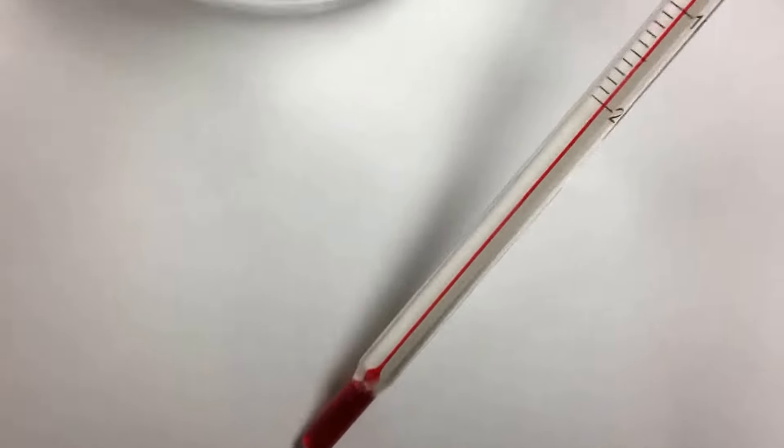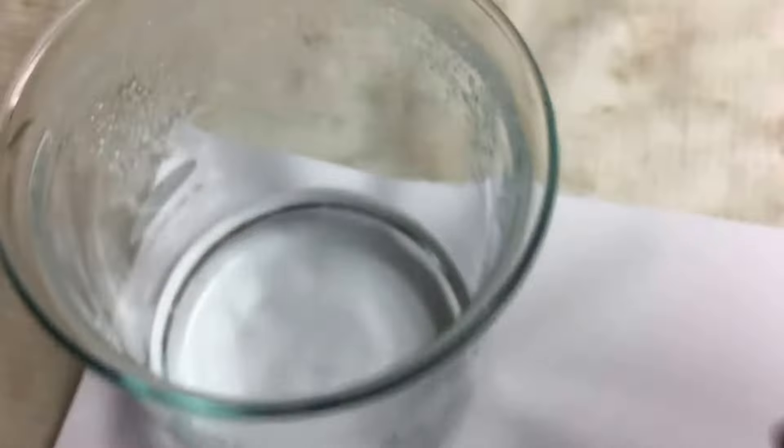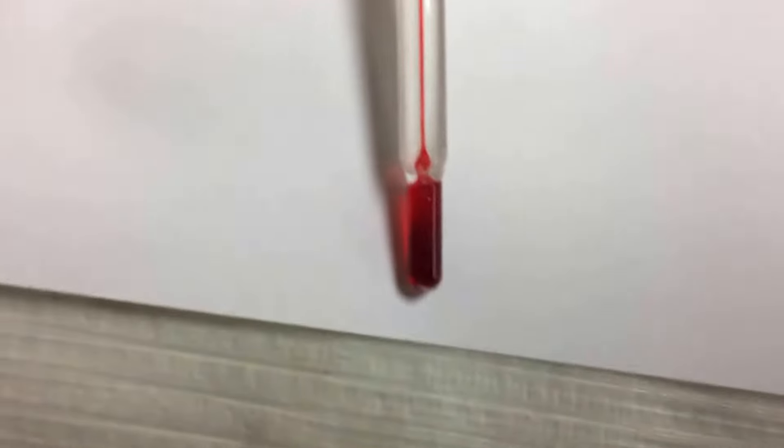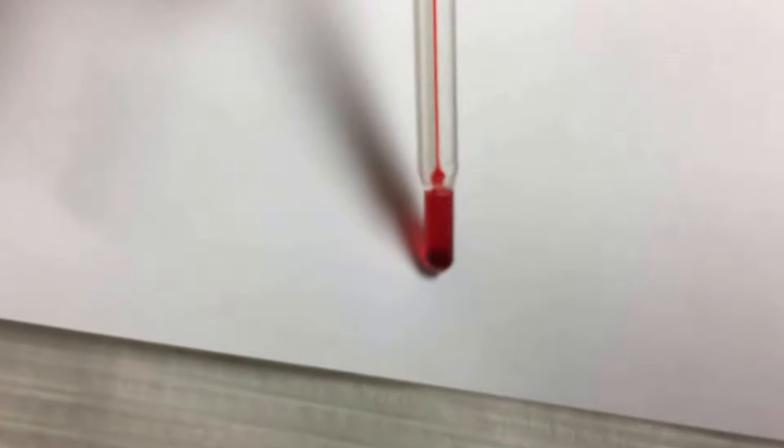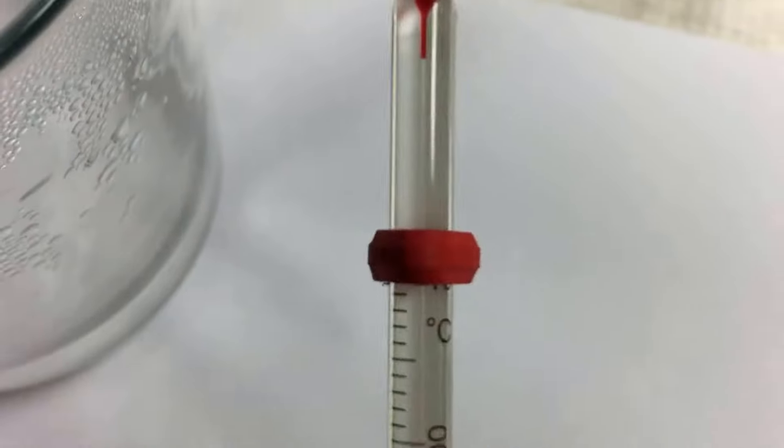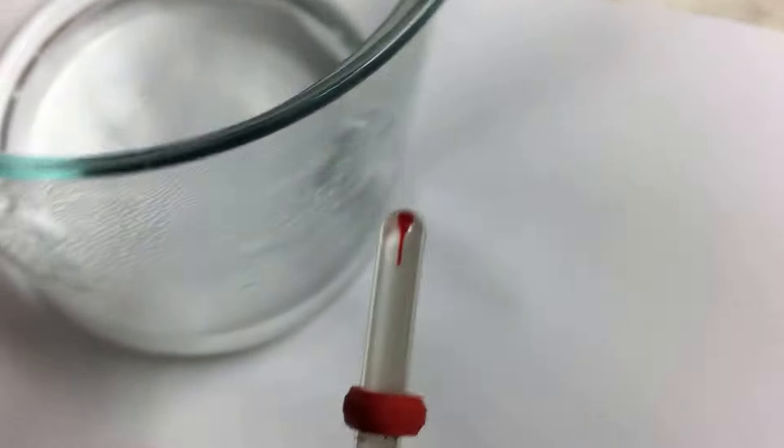This thermometer is reading 100 Celsius for boiling water, but I'm trying to fix it partially. This one contains mineral alcohol, not mercury. You can see it up to here, and it just broke into the top parts. So I'm attempting to fix it with boiling water.